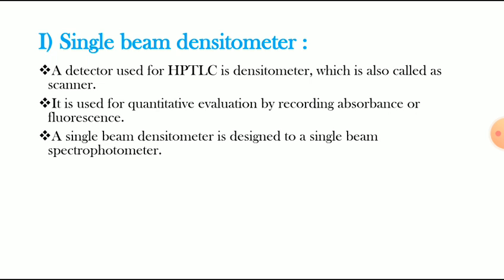A single beam densitometer is designed like a single beam spectrophotometer. Generally, densitometer and spectrophotometer are both around the same.